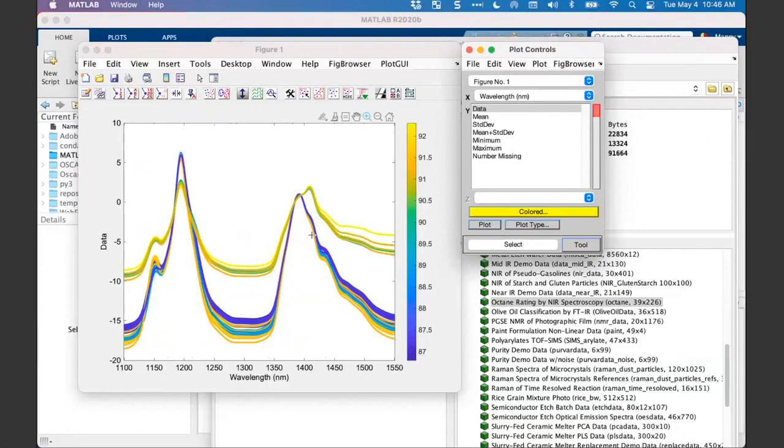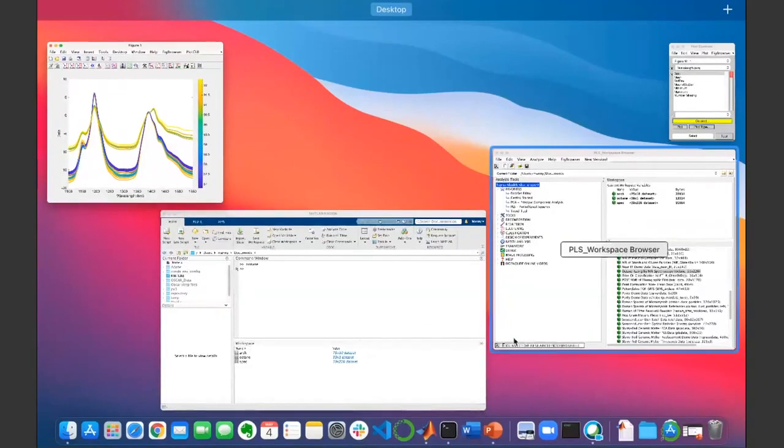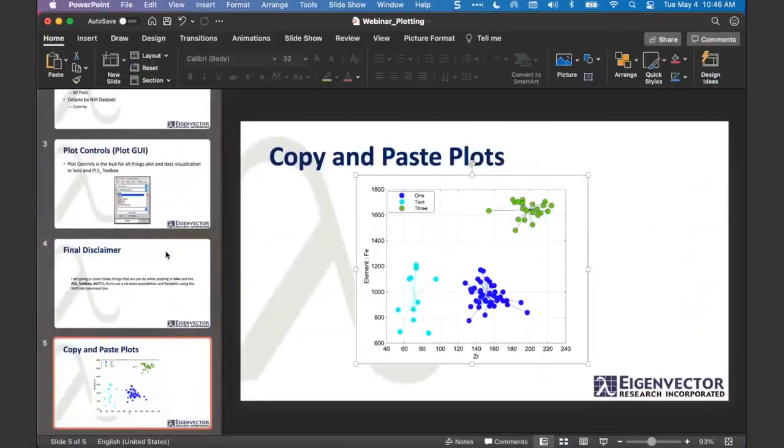You could certainly do that. Applying them is something that you could do in PLS Toolbox under MATLAB, but we don't have a tool to add them to Solo.